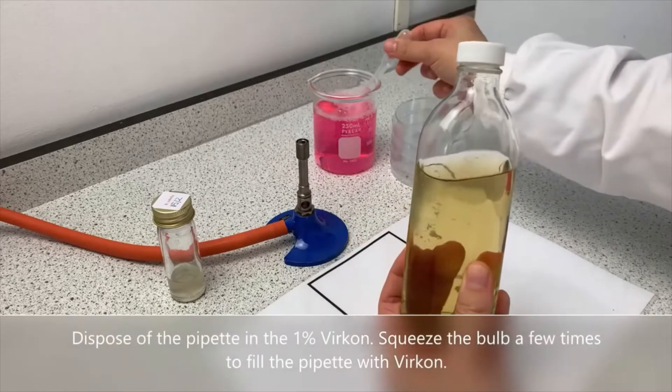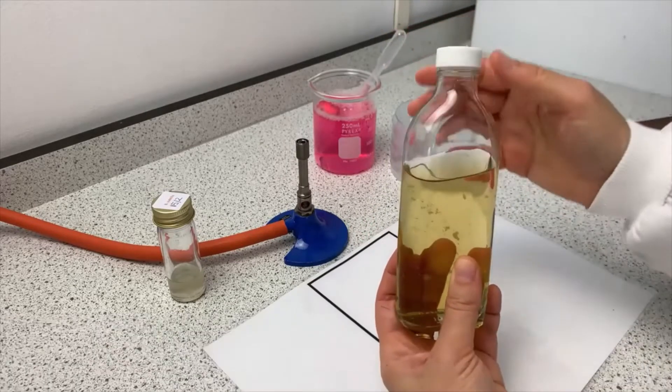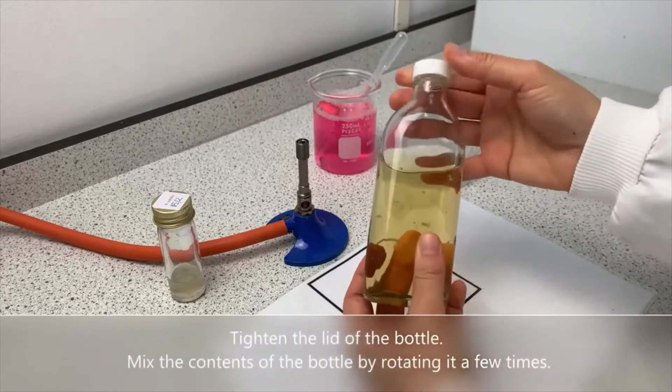Dispose of the pipette in the 1% vercon. Squeeze the bulb a few times to fill the pipette with vercon. Tighten the lid of the bottle.